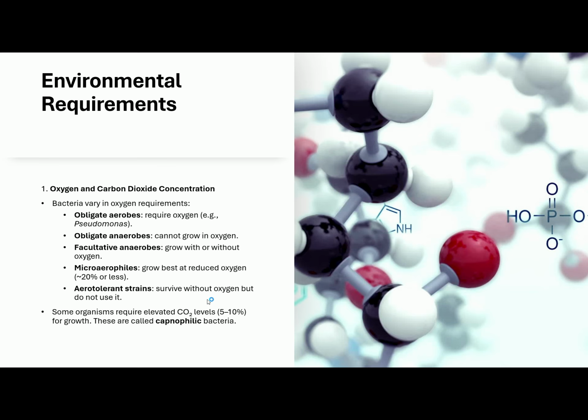Now, yung certain bacteria nyo, class, would require high or elevated levels of carbon dioxide, usually 5 to 10%. So pag ganun ang bacteria nyo, they require 5 to 10% carbon dioxide. They are known as what we call capnophilic bacteria.